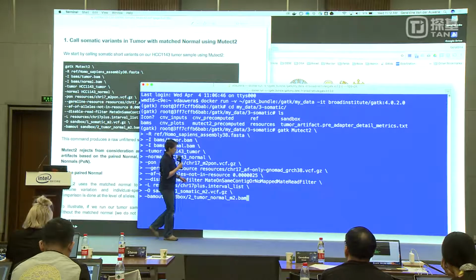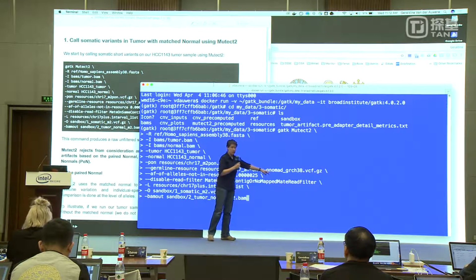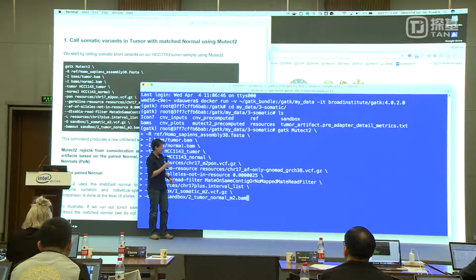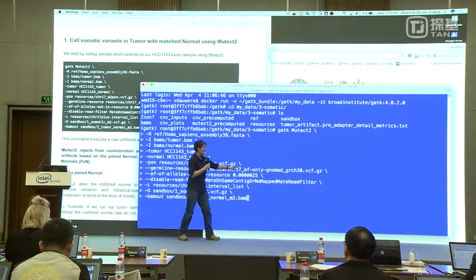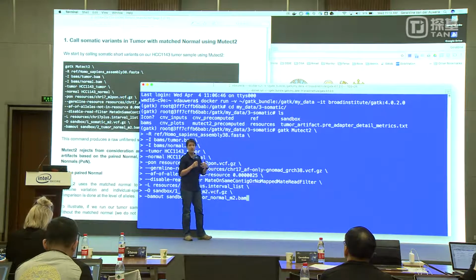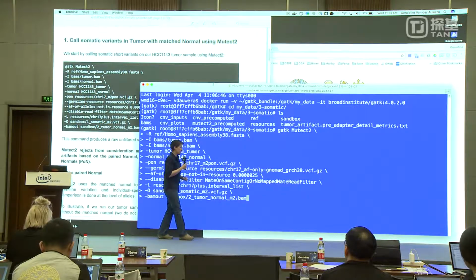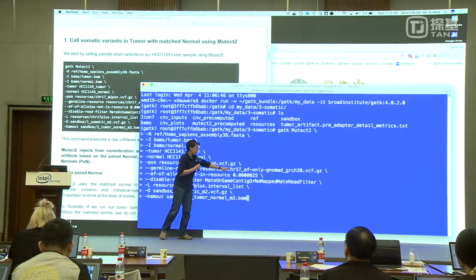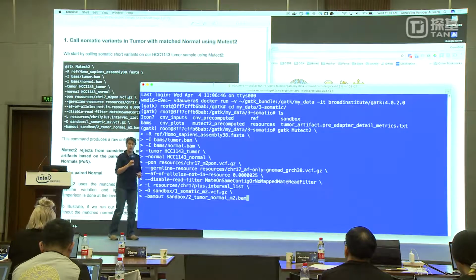And you can see here that in this case, we're using a subset of the gnomAD resource against the hg38 reference. This resource must have the population allele frequency annotation in the VCF. And it can be a sites-only VCF, so we don't need to have genotype information for any samples, just the sites, but it does have to have the AF statistics. And in this case specifically, we're just using data from chromosome 17 for this particular tutorial, okay?